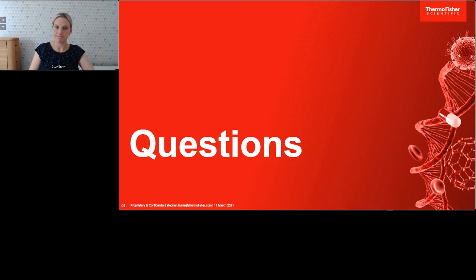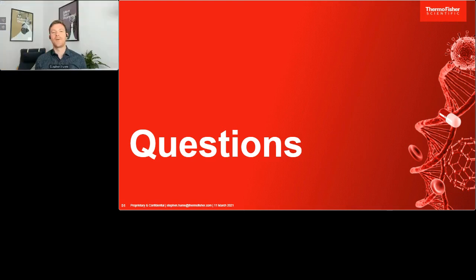Thank you, Susie, and thank you, Manu. Nephi, one for yourself. This is from Bruce, and Bruce is asking, how do you deal with dissolved CO2 when you're using such large bioreactors? Are the systems really scalable to 5,000 litres?